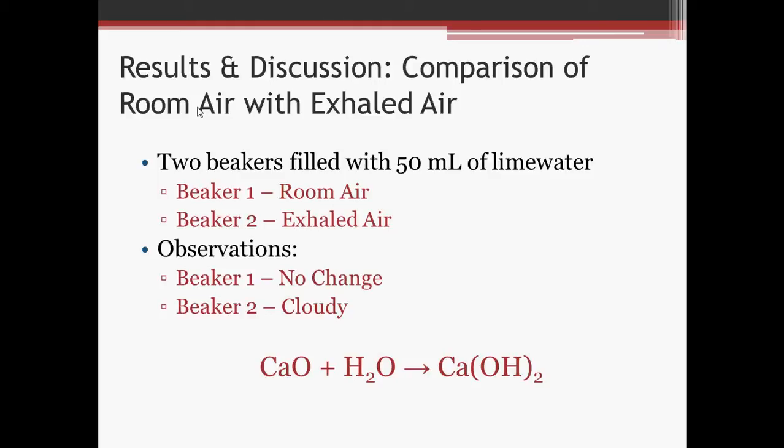Comparison of room air with exhaled air. 2 beakers were filled with 50 milliliters of lime water. In the first beaker, room air was bubbled into the lime water for 2 minutes, being continuously observed. In the second beaker, exhaled air was bubbled into the lime water for 30 seconds, also being continuously observed.